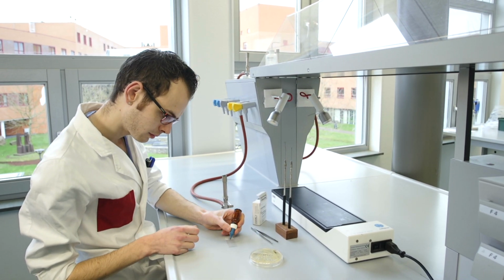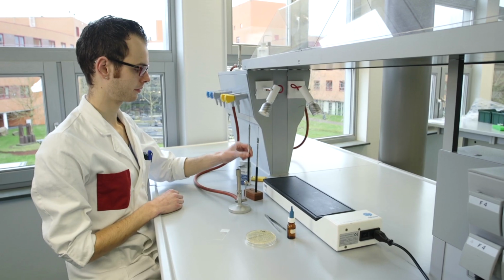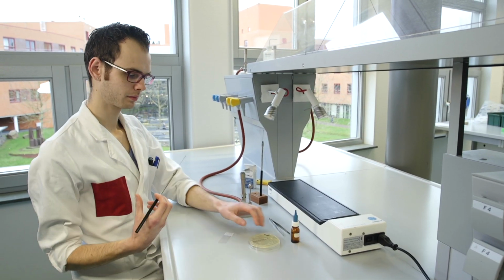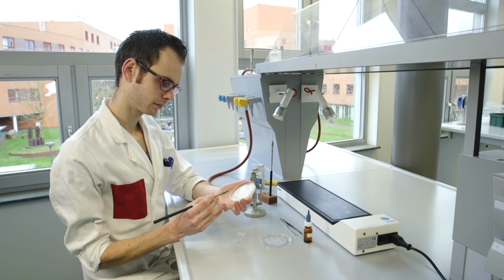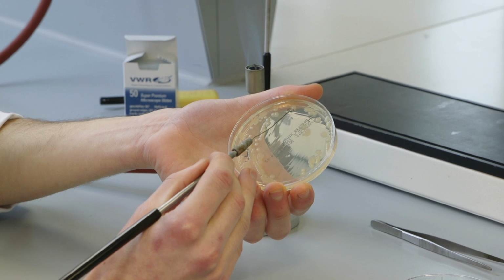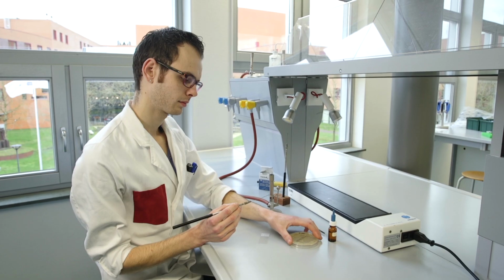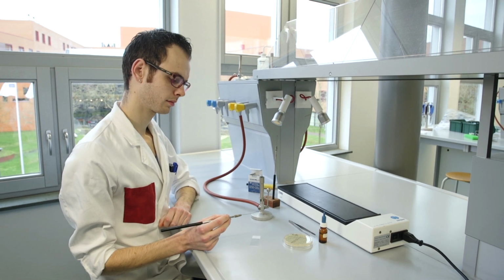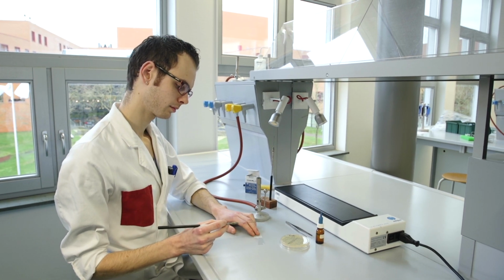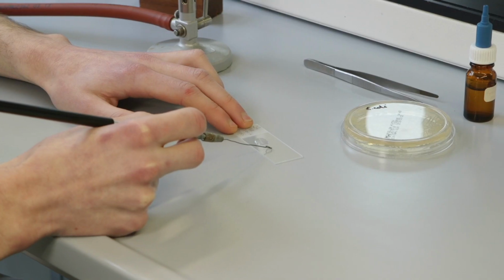Put a small droplet of saline on the slide using a squeezy bottle. Flame sterilize an inoculation loop and take a sample of bacterial culture, preferably a single colony. Be sure not to take too much material, just touching a colony gives enough cells for a stain. Place the inoculation loop on the slide next to the droplet of saline and spread the bacteria on the slide.